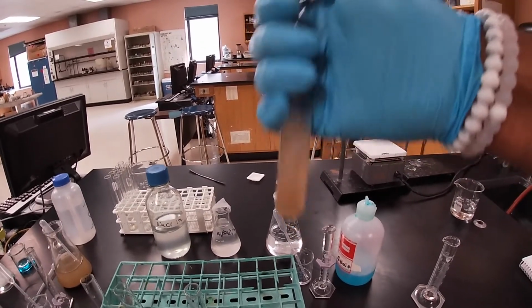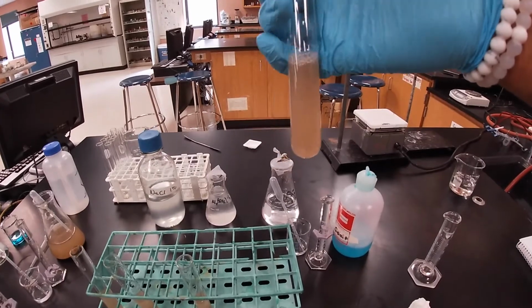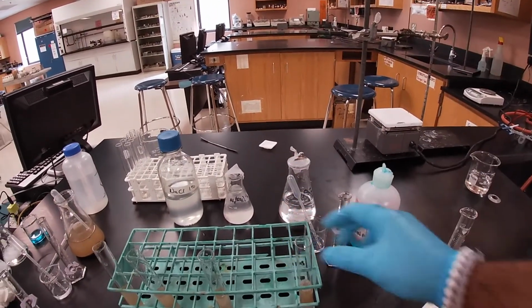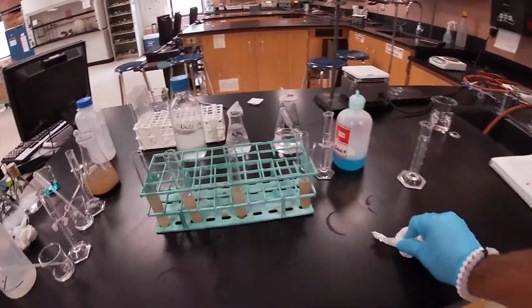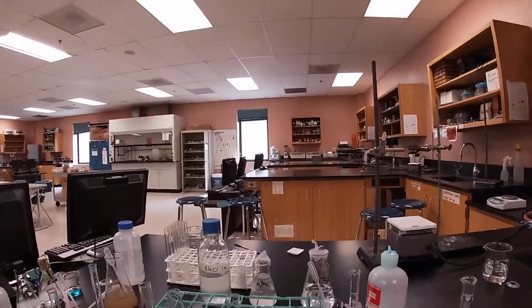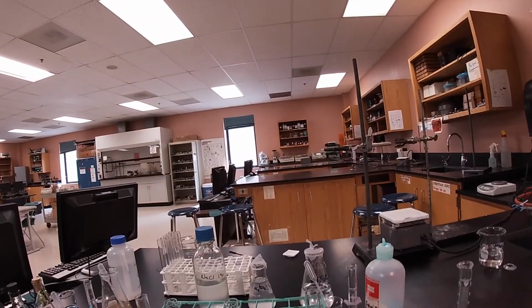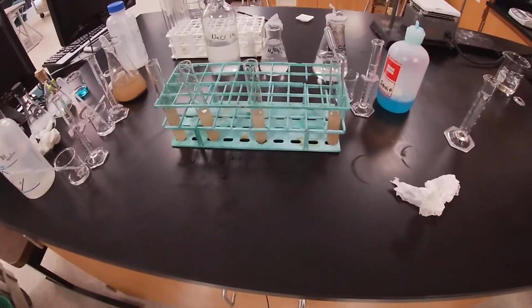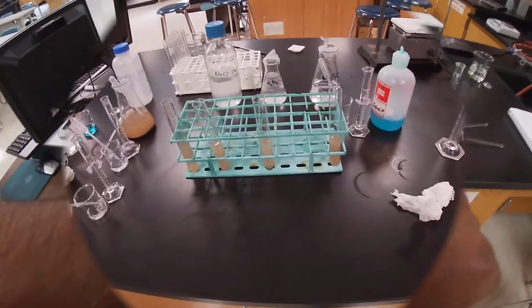All right. And so now that we got our shaking done, we're gonna let our solutions settle for about 15 minutes. Let me start a timer. And we'll come back in 15 minutes. So like I said, timer set.